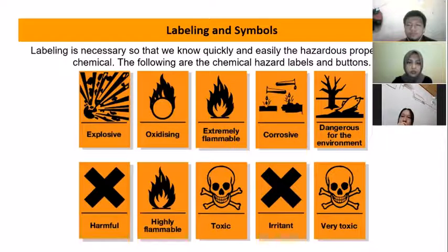Ecological disturbance. Example, tributyl tin chloride, tetrachloromethane, and petroleum gasoline. We avoid direct discharge into the environment. Instruction for how the chemical laboratory works. Irritant, hazard: irritation to skin, eyes, and breathing apparatus. Example, ammonia and benzyl chloride. Safety: avoid inhalation and contact with skin and eyes.